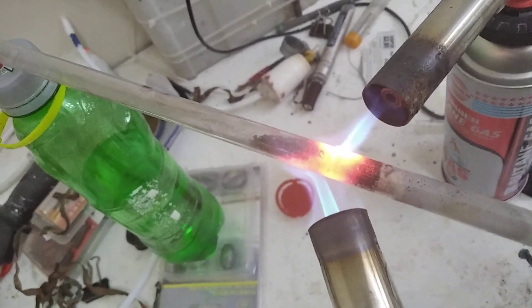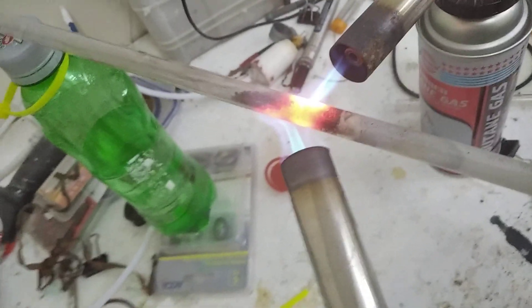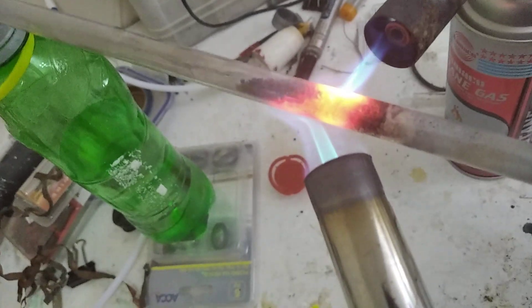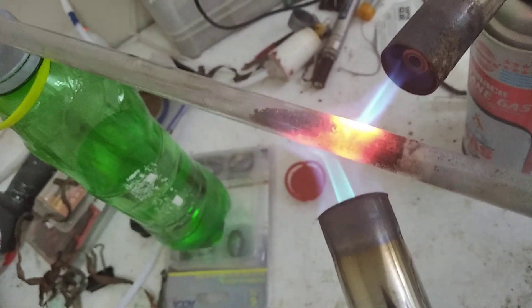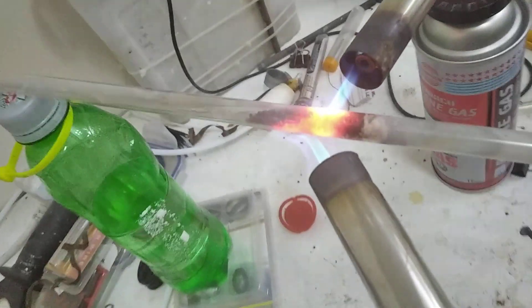Over here we have our MMO catalyst. It is a mixture of manganese and copper oxide. It's being heated at low heat by these two flames because it cannot self-sustain like platinum, but it is cheaper.